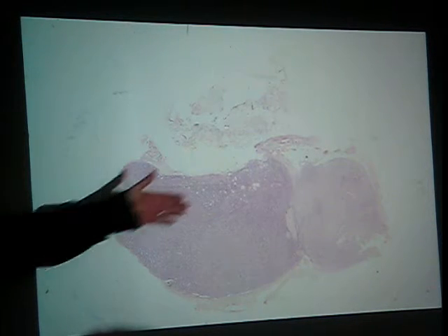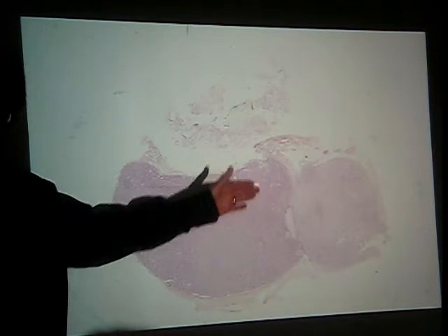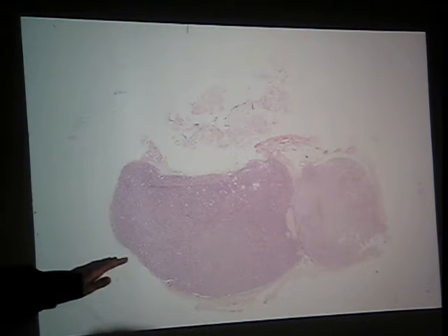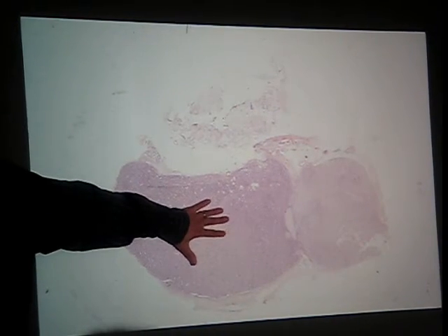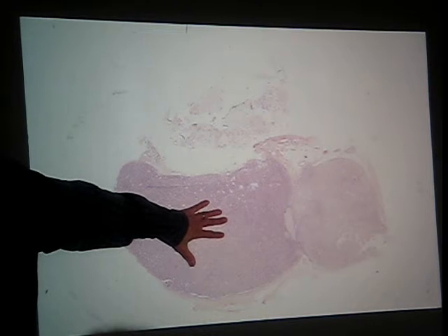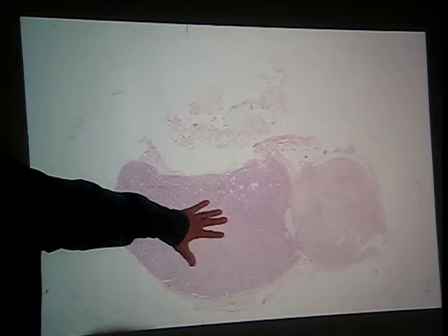Pituitary, right? And remember, this is a parasagittal section. So the stalk, or the infundibulum, is out of the plane of section. Many of your pituitary glands were interesting in that they were sections like this, looking down. All right? But what part is this? Or, fancy word here?